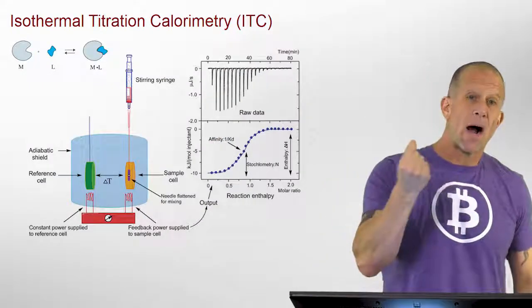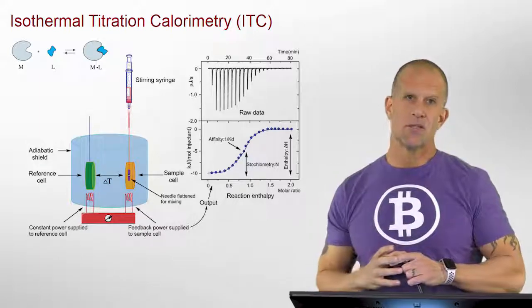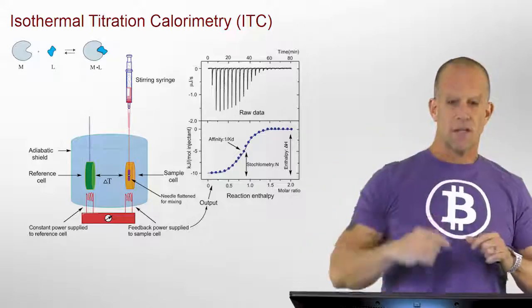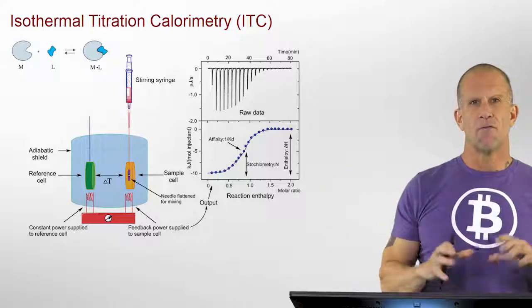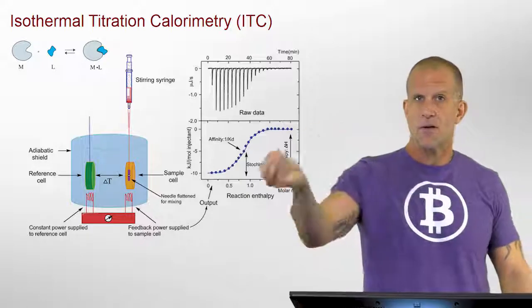So in biological systems, oftentimes the change in heat, unlike something like combustion or looking at bulk amounts of material where you can use milliliters to pour and see large temperature changes, involves very small changes in energy or, in a sense, associated heat or temperature.